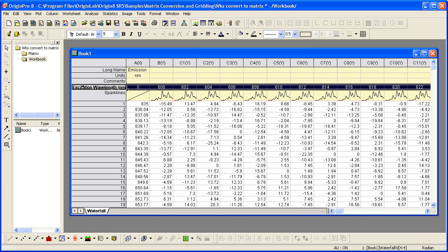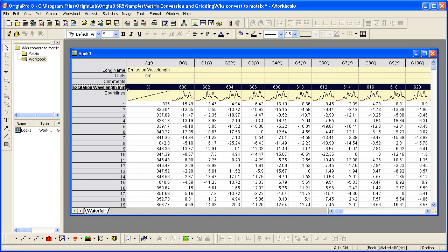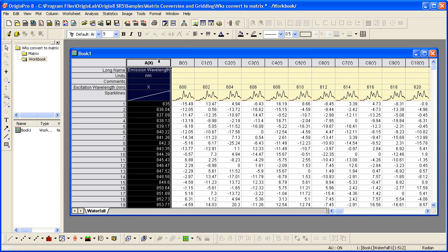So any header row will work. The emission wavelength, which are the Y values—again let me do that double click to auto-size so we can read the full text—is this emission wavelength, this column, that contains the Y values. So it is the first column in the worksheet. Then the rest of the columns, or the rest of the cells in the worksheet, are the Z values for each X and Y.